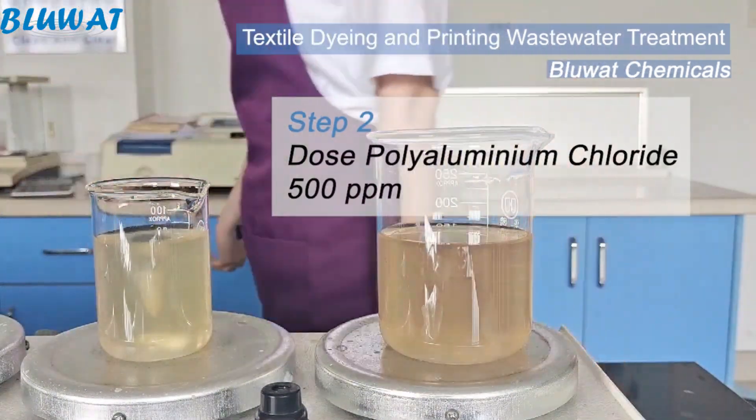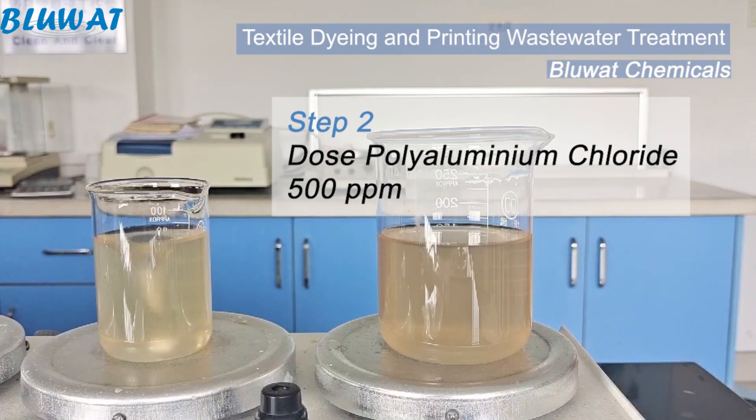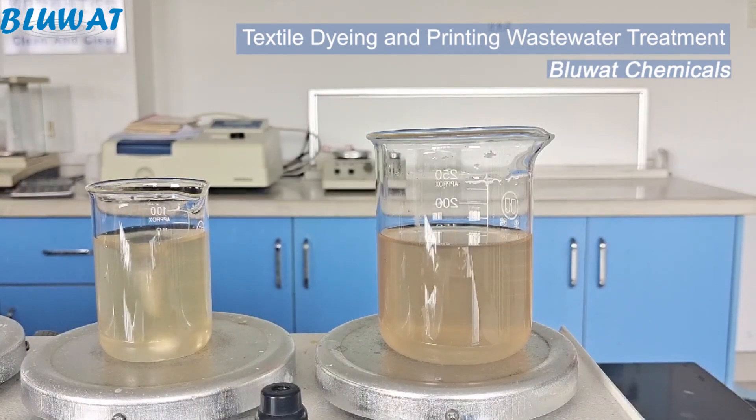Second step: dosing PAC solution, mix with effluent completely. This is for promoting the floc formation.